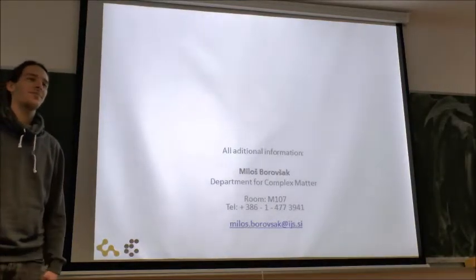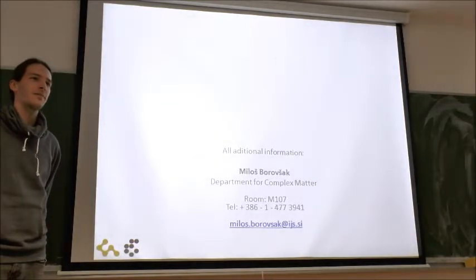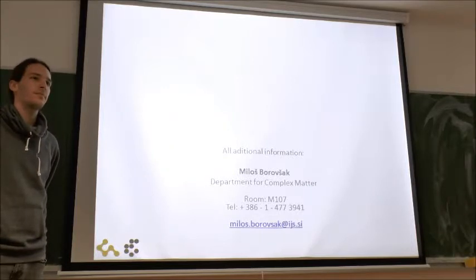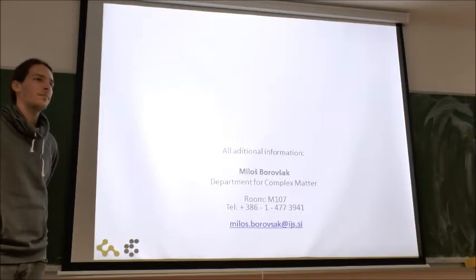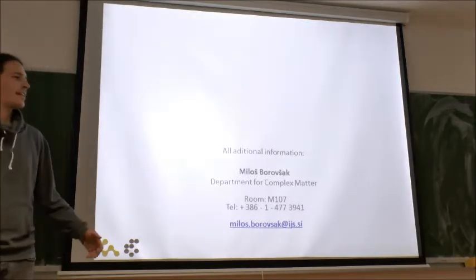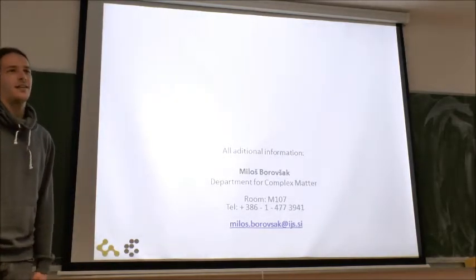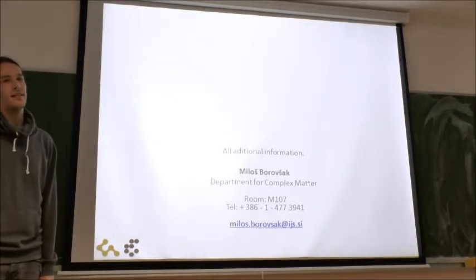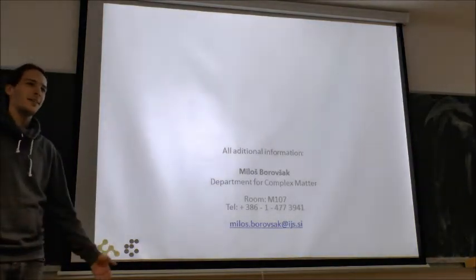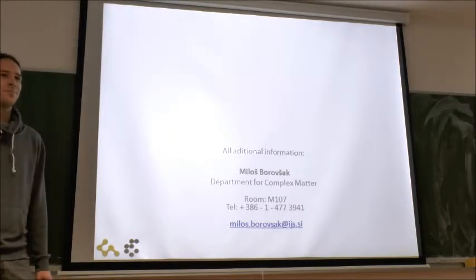I have two questions. The first one, what is the typical enhancement factor that you get in this method? And second, whether you can also make measurements with samples in liquid, so you have a liquid sample in this device. The first question: the enhancement is around 5 to 15 times. So one order of magnitude, that's typical. I mean, it can be better, but with the tips we made here, we didn't achieve a bigger enhancement yet.